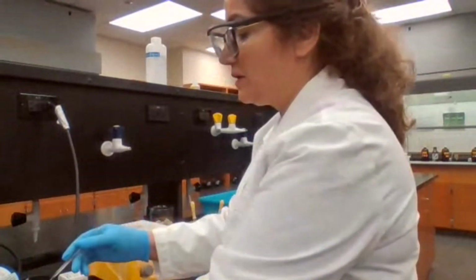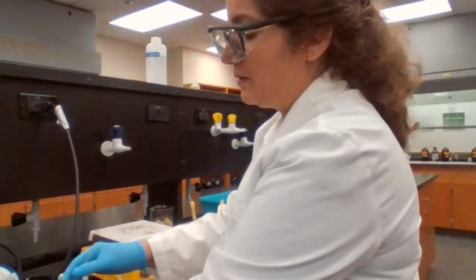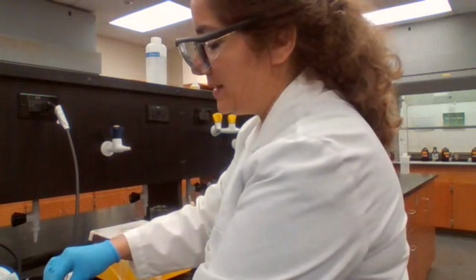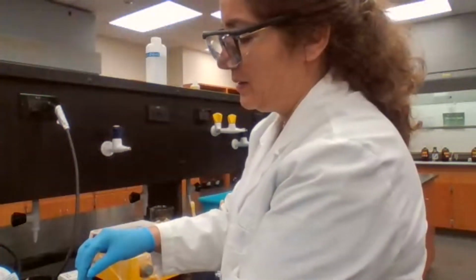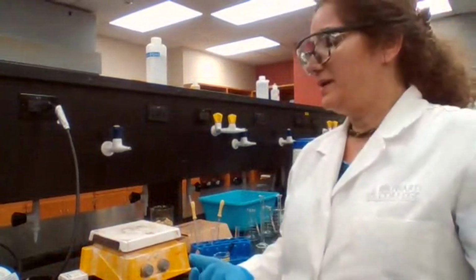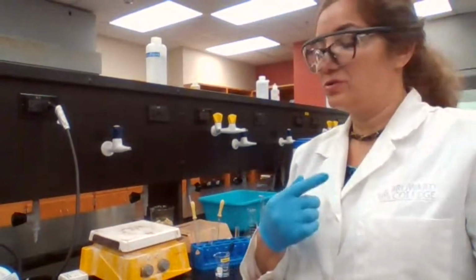And when you have your crystals, you continue with the vacuum filtration. After 5 minutes in the ice, you would place in the vacuum filtration, 5 minutes, to run the extra 5 minutes to get most of the moisture away. Then you would place in the oven to dry.